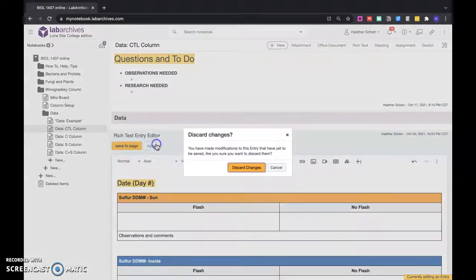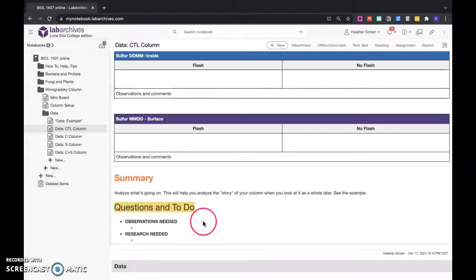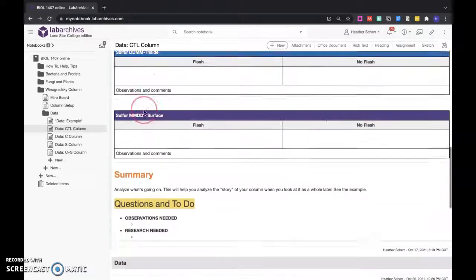I'm going to delete and cancel this now, because I don't want one at the bottom already for you, because I want you to copy it every day. Oh, I should do this though. Okay, if I do a copied entry. Now, once you have that day, next time you come back, you'll do the same thing. You take your template and you're going to copy it.